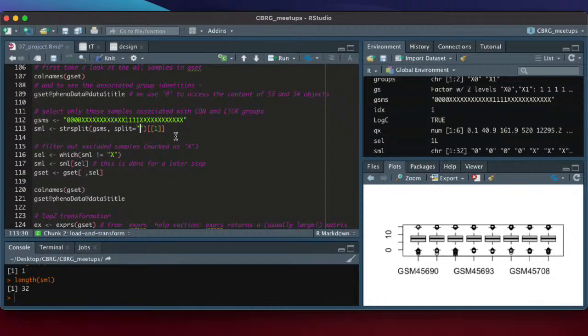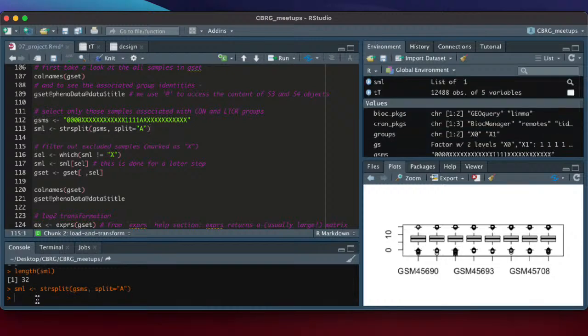So you are splitting by nothing, obtaining just 1. But if you split, and maybe X is a wrong example, but if you introduce a character in your vector, like an A or whatever, and then split for A, now you will obtain a list of 2. Oh, got it.